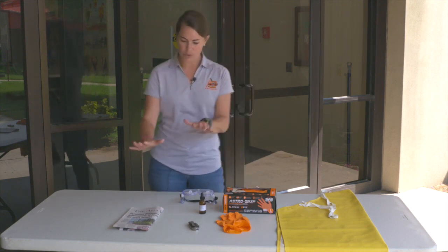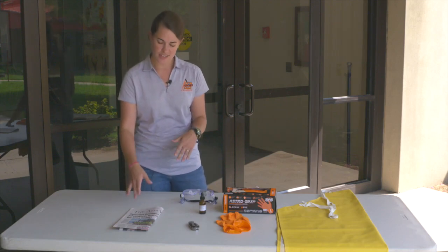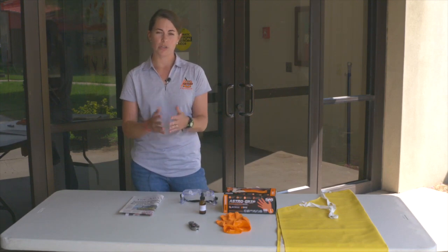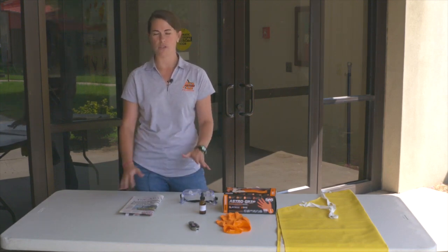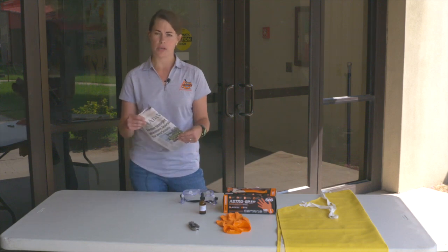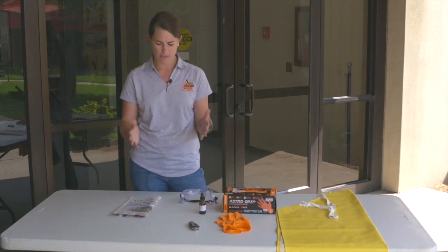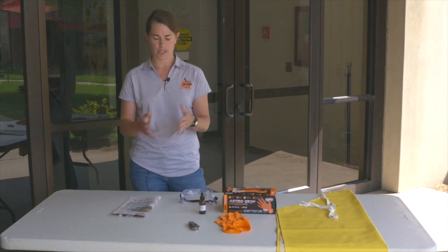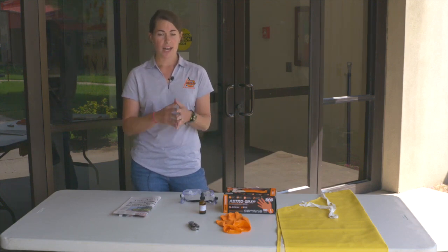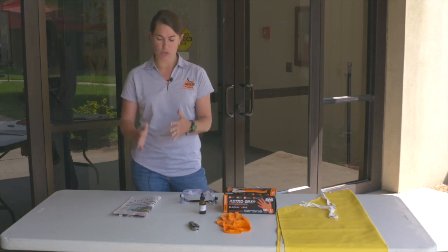So to start with, you need something to cover a table or whatever surface you're working on. If you're in a place where you don't want the surface to be damaged, cover it with some newspaper or some sort of brown paper — anything that would protect that surface. We do encourage you to test outside, but if you need to, have some covering.